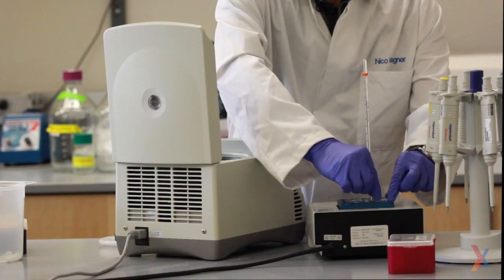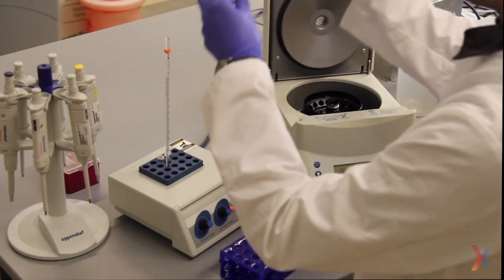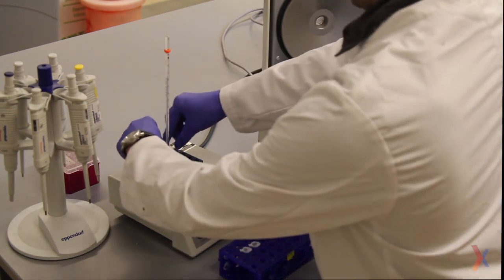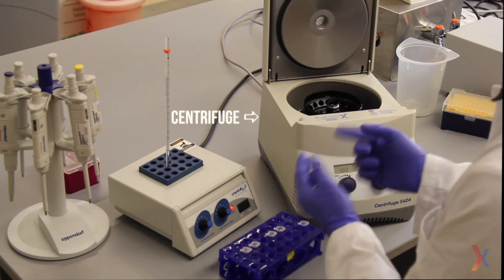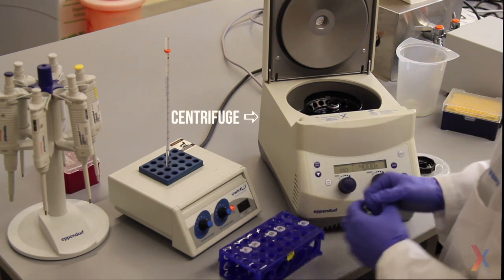After five minutes we can come back and take our samples back out of the heat block. Just in case anything crawled up along the sides of the tubes, we put them in the centrifuge for a very quick spin.